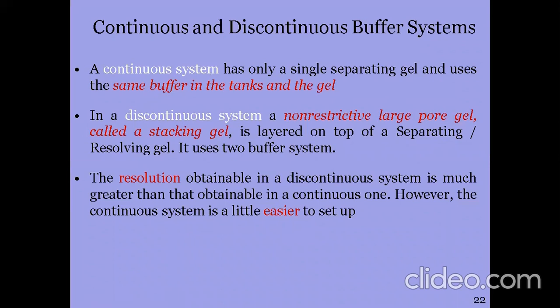But the resolution and results are more preferred in the discontinuous system. The one in which two gels, stacking and resolving, are made is more preferred.